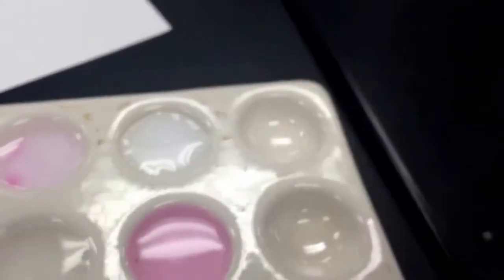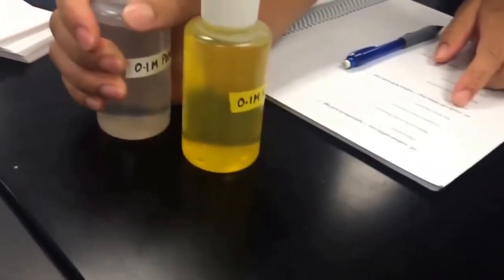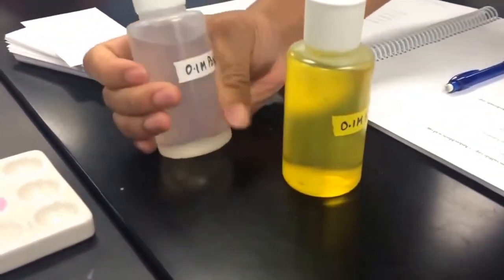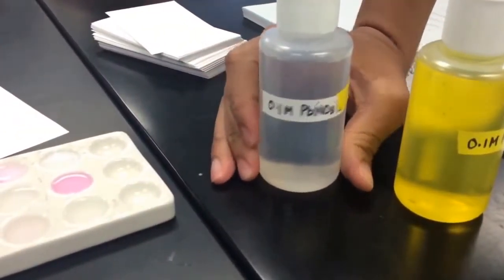There you go. So for number 10 and 12, we were going to do sodium sulfide and hydrochloric acid. And number 11 was going to be copper sulfate and sodium hydroxide. However, we do not have those chemicals because they're too dangerous for our inexperienced hands. And we're going to do lead nitrate and potassium chromate.